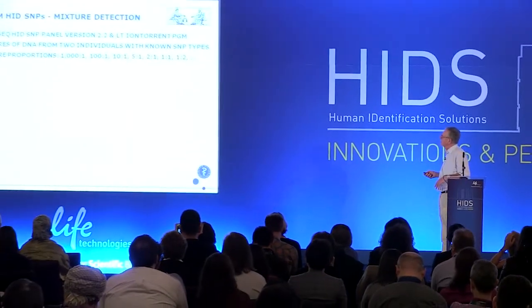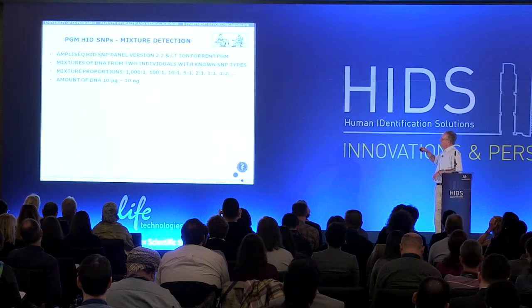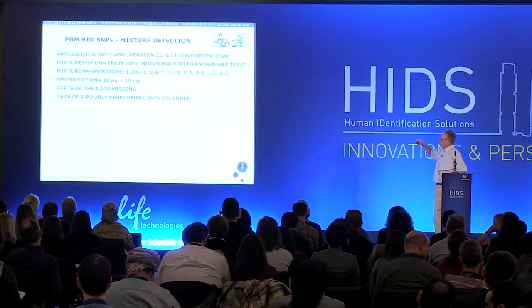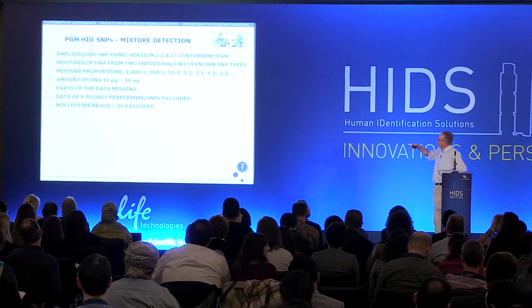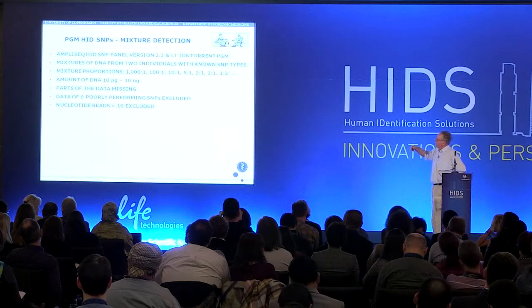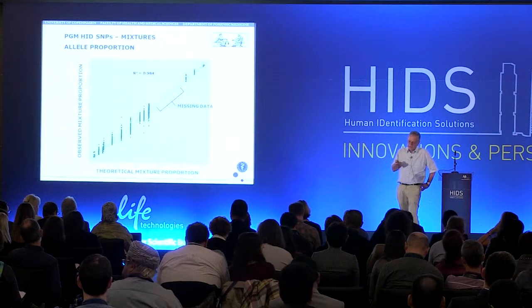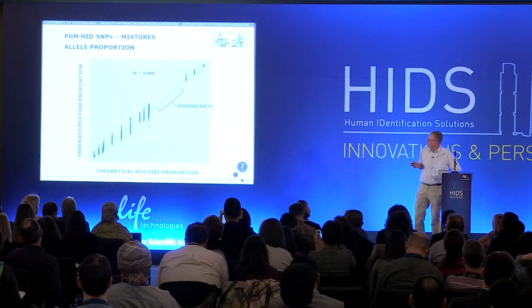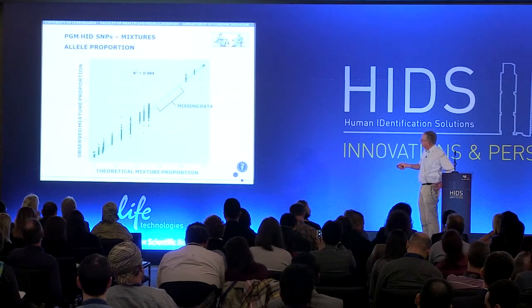Mixtures. So we made an experiment with this kit, and ended up with allele proportions here that were rather nice.